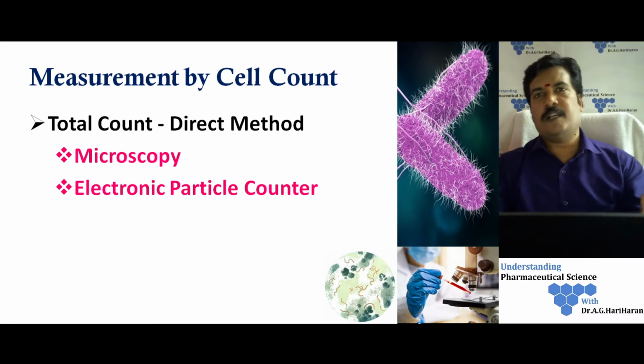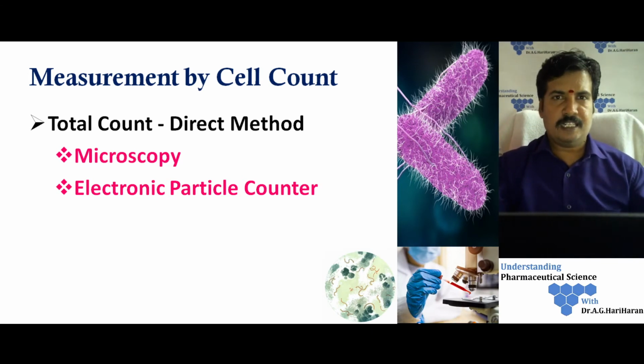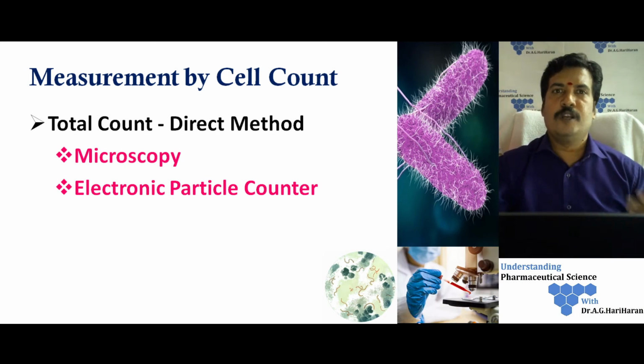We can directly count how many cells are present in a particular sample. Whether the cell is living or dead doesn't matter. We calculate only the total count, the total cells.